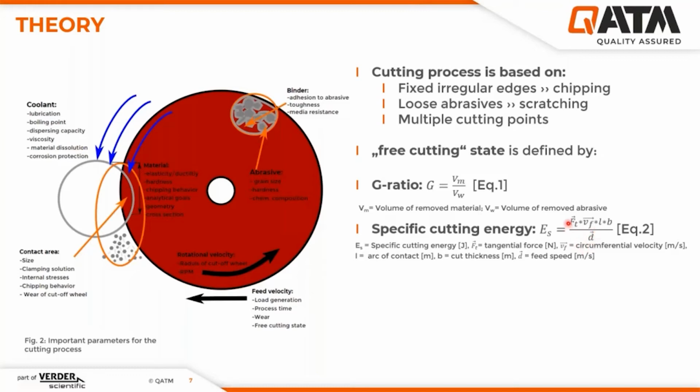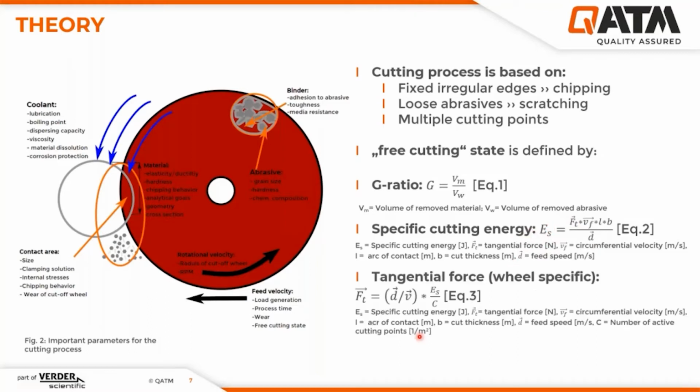And you see that these two parameters counteract each other, because otherwise ES would never stay constant during the free cutting state.